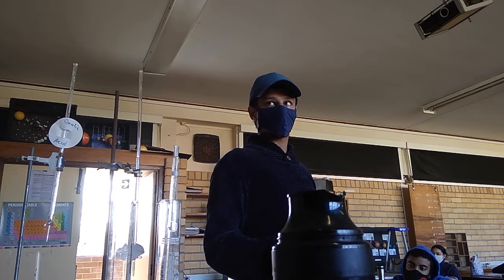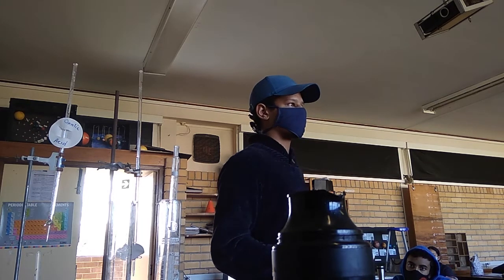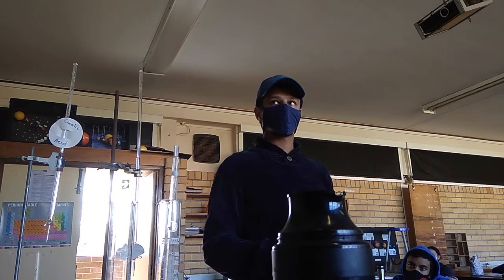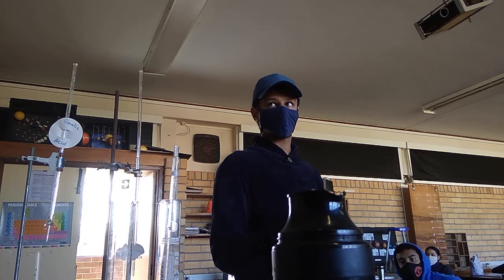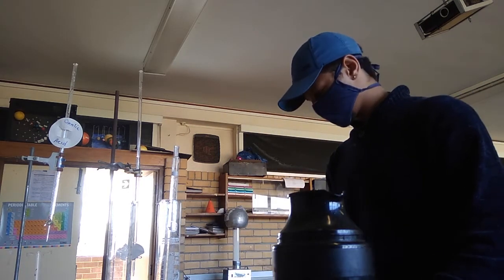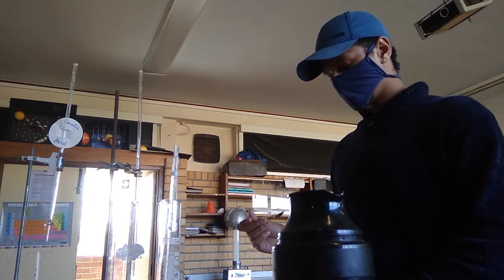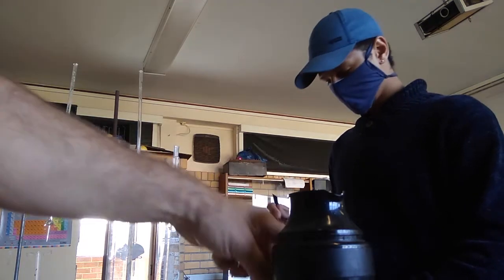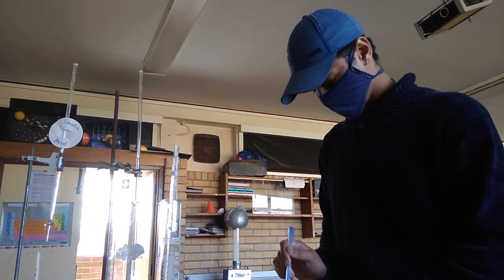If you leave that bottle lid open, it absorbs the water from the atmosphere. It gets heavier and gets sticky and clumps together. But now I just shake it, I know it's good. Okay, you can open it again. And then just grab a spatula of it and throw it into that water that you've got and stir it.